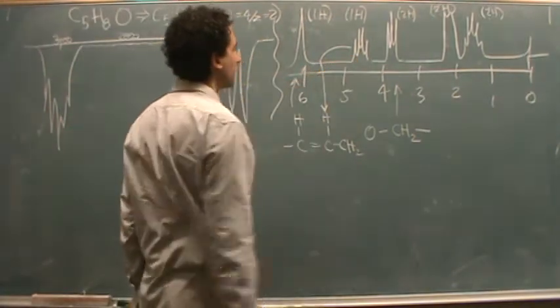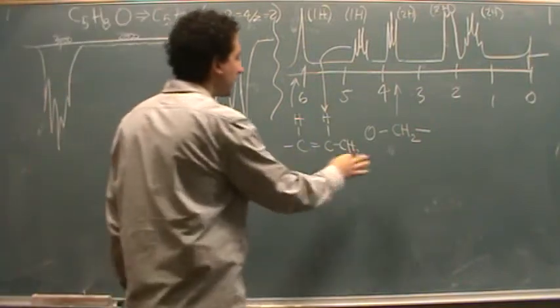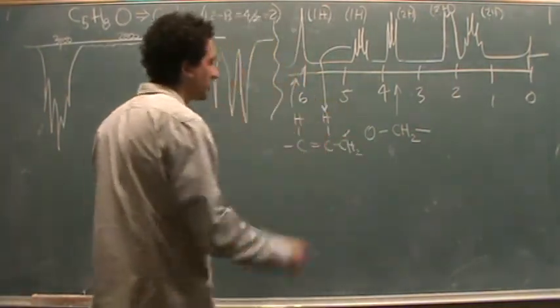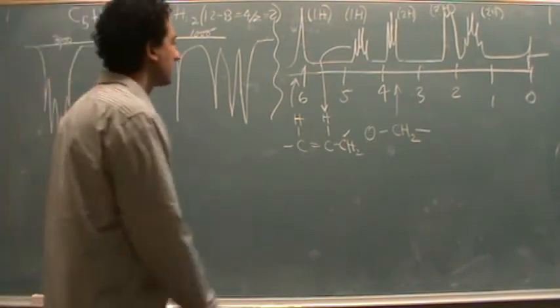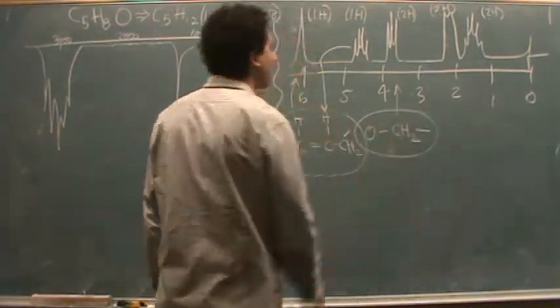Because it's giving this multiplet sort of look there. So from the diagram that I have, that could be a quartet, but it is a little hard to read. Even the NMR that I have, the original, is pretty messy. So it's definitely a multiplet. I'm thinking these are close to each other. This could be, of course, bonded to something else. So right now, I think we have something like this and something like that.